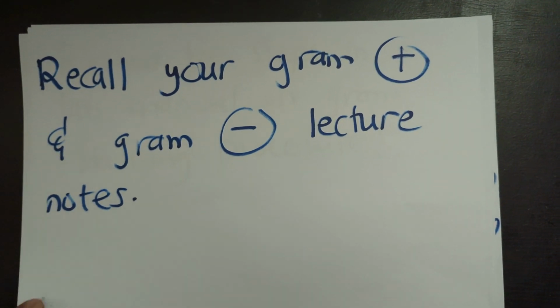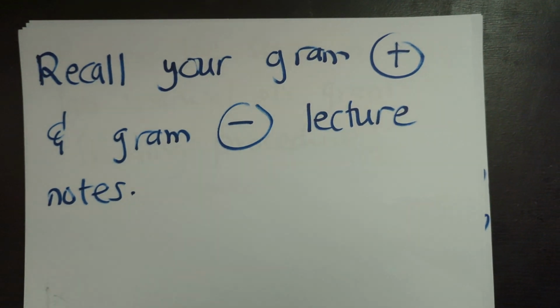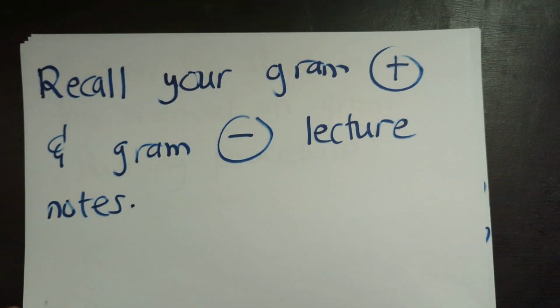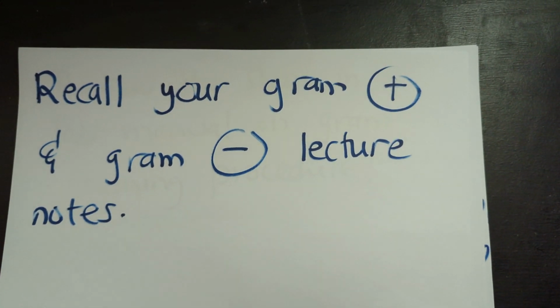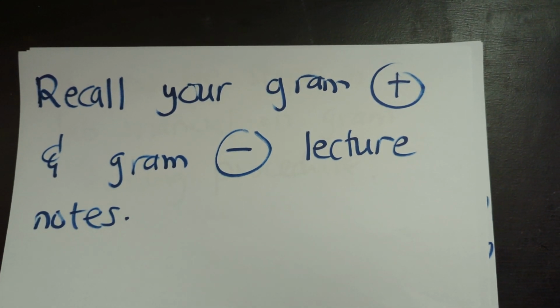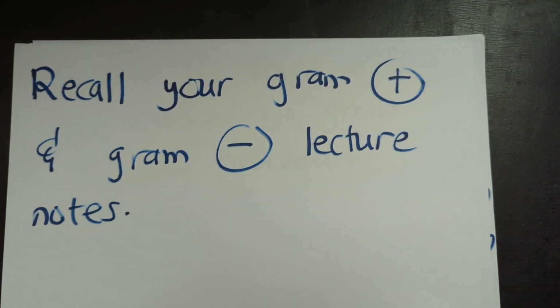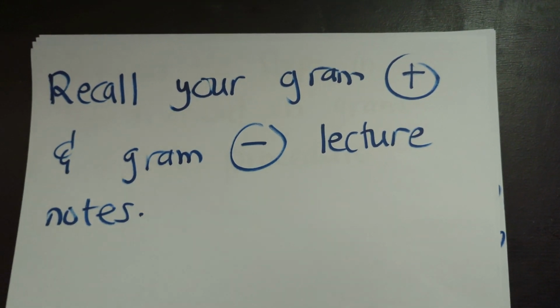Hope I said that right. So we are using that principle to differentiate our bacterium into those 2 classes, or that distinct feature rather of bacterium.